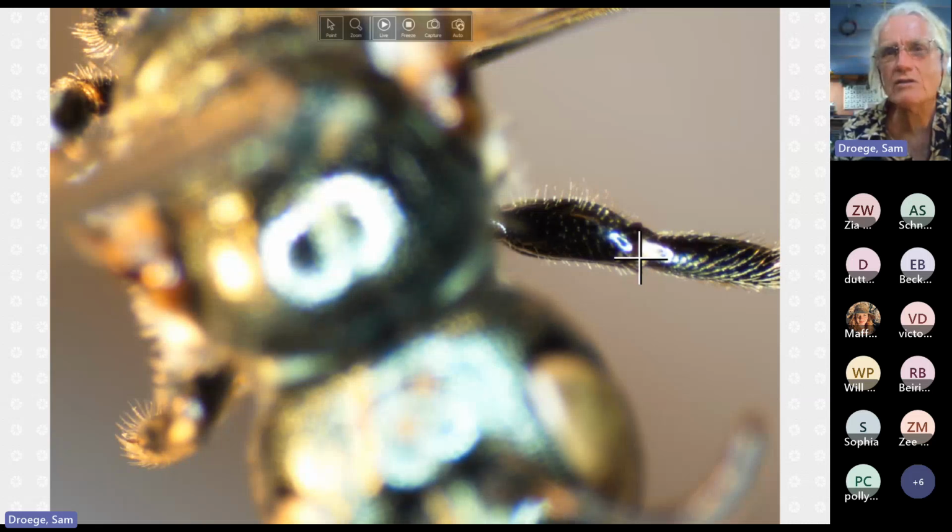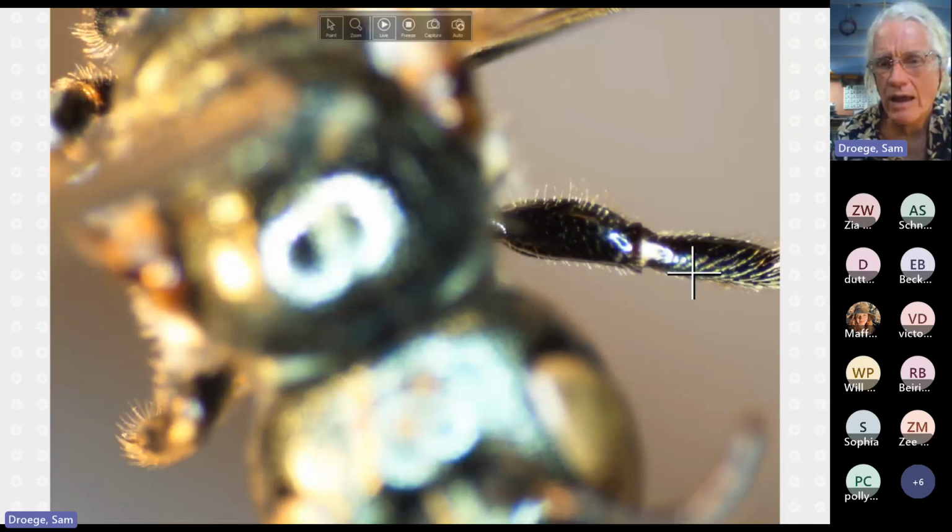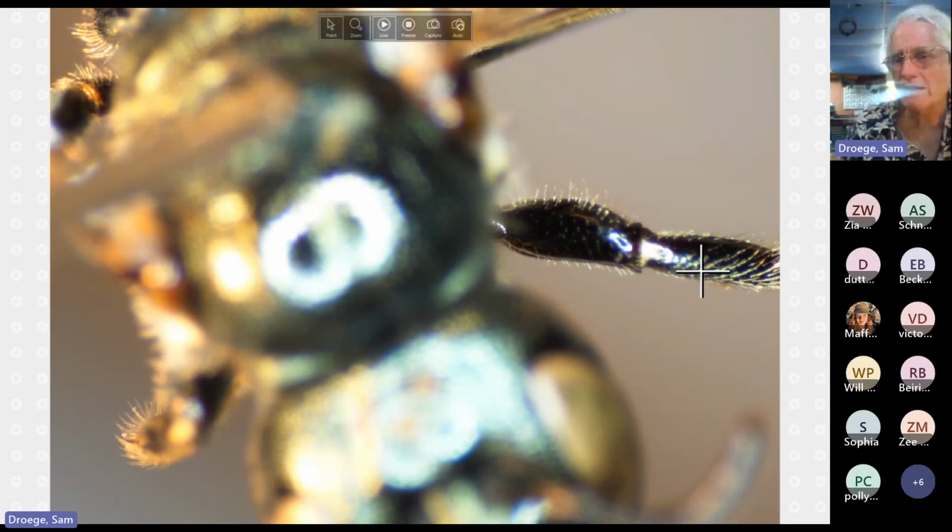It's basically just an ivory, again not bright white, mark that is hugging up to the tibia, but the femur has no mark whatsoever on it, and this white is restricted to the bottom. Every once in a while, this area that becomes a stripe in others has some sort of translucent amber feel to it. And that's a time to set that baby aside and come back to it.